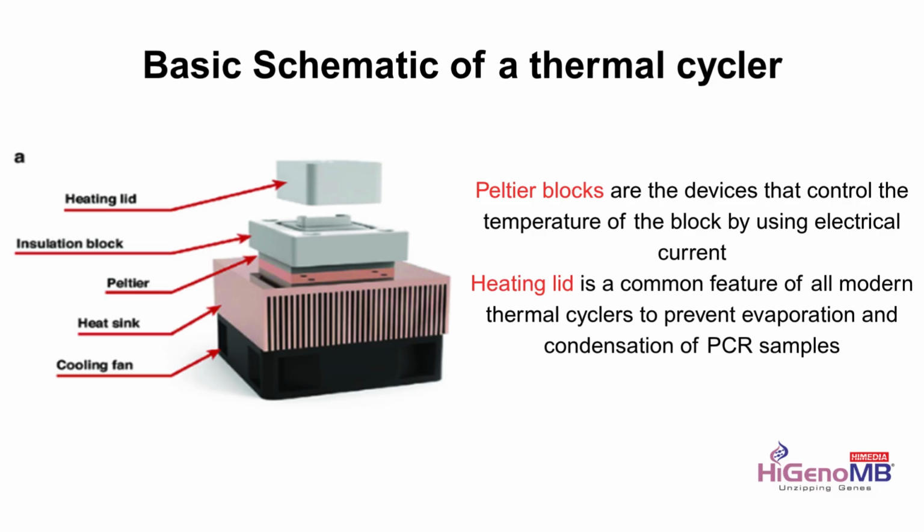Because of this, since the temperature in the external environment is higher, evaporation is avoided. This is the use of the heating lid in the thermal cycler.